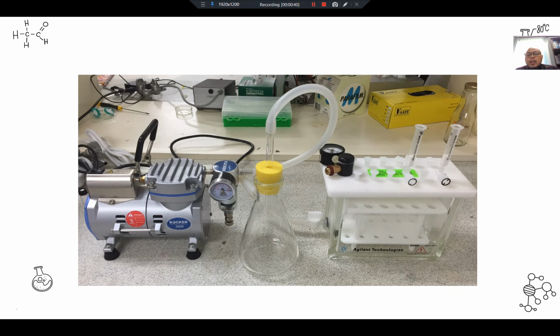Right, here is the equipment necessary for SPE. If we look here, we have a pump. The pump is to help suck the liquid down. Here is the SPE cartridge, here is the SPE chamber. And here I'm not really sure what the purpose of this thing is. Maybe when it sucks, it does 2 steps. This one goes in here, this one goes in here.